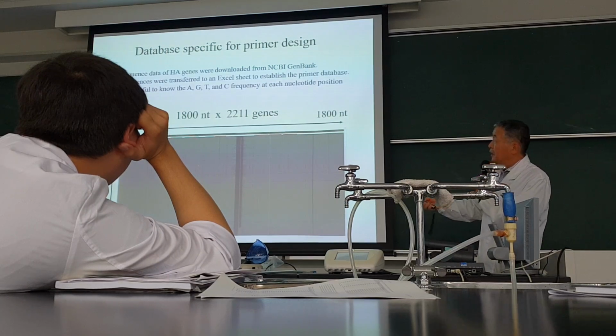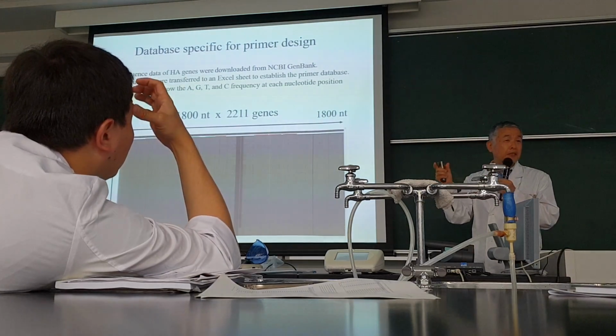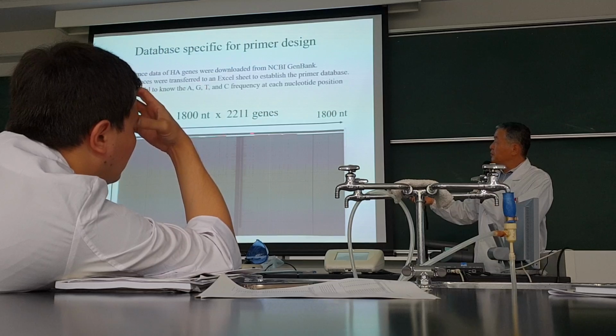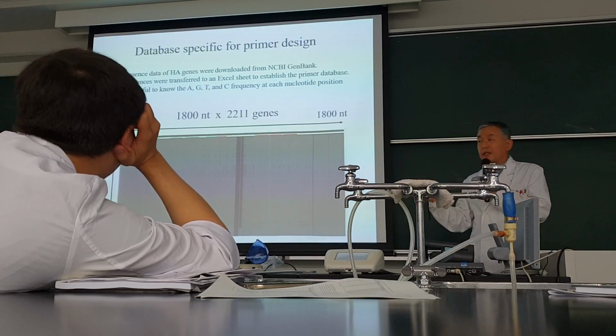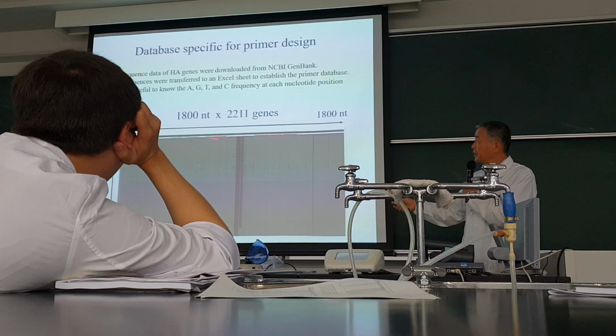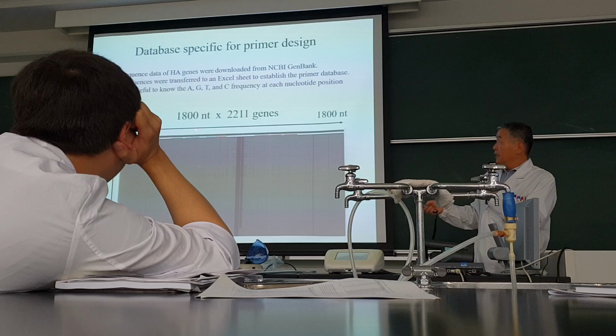There are some green bars containing each primer site, and also red bars containing the forward and reverse primer sets.